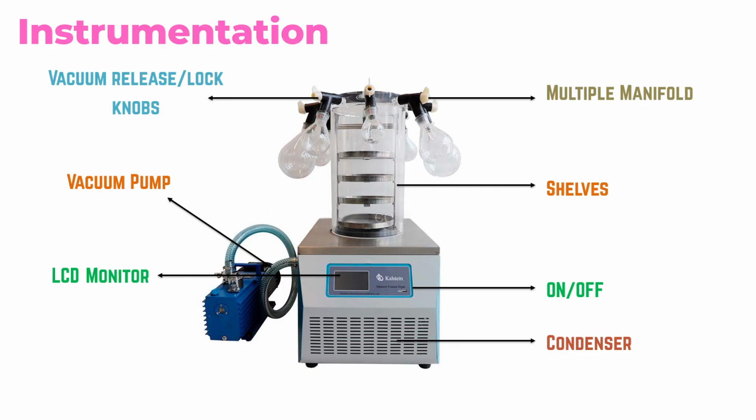The next step, the fourth, is primary drying, as we discussed earlier. But with the standard operating procedures, first of all you need to start the vacuum pump to create a vacuum, then set the shelf temperature and chamber pressure as per the requirement of the formulation. Then heat is applied to the shelves to promote sublimation of the frozen solvent.